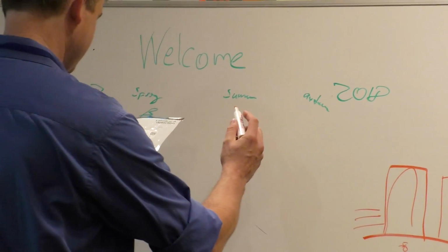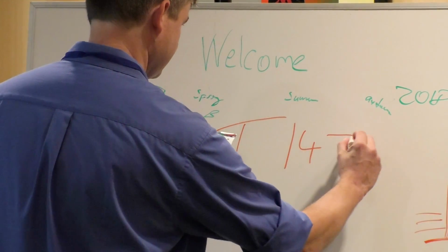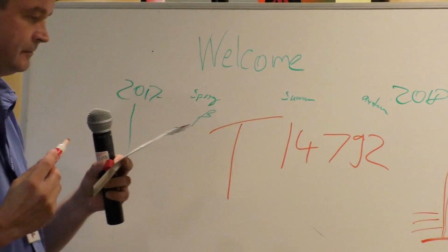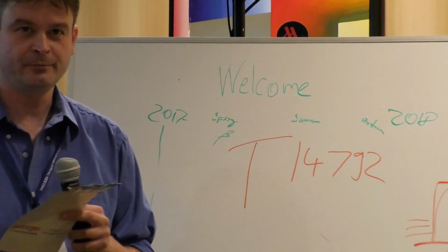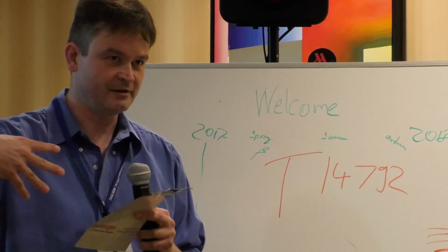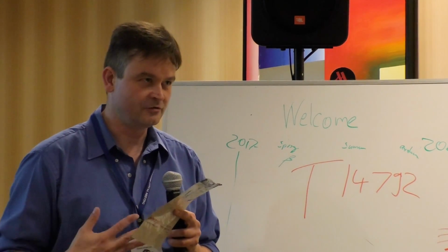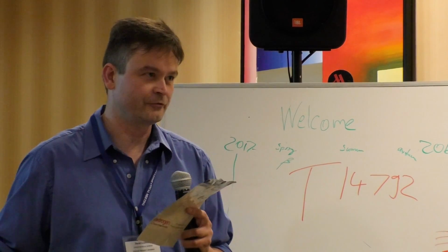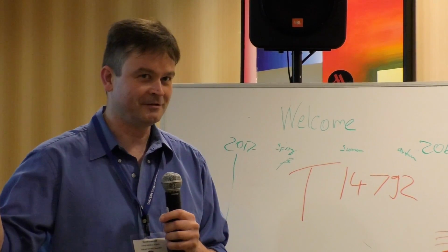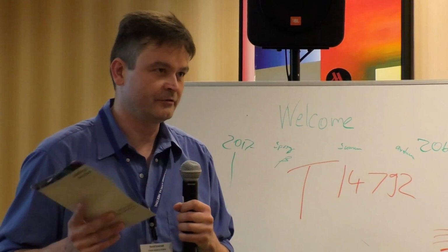Yes. I can tell you the order number: T14792 at Invitrogen, Fisher, whatever you call it nowadays, will get you a slide that has beads in different sizes. They're all multicolor beads, and you have a ready sample to go. You can buy that right away, and you don't need to prep beads or deal with the hassle of getting used to handling beads. They're stored at room temperature, and you can carry them along and ship them wherever you want to go. I really suggest you have that.